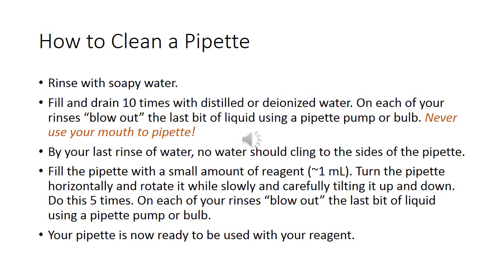This will be different from what I'm going to tell you in a few minutes. I'm going to tell you in a few minutes that when you're measuring, you never blow out a pipette. But when you're cleaning a pipette, you want to make sure that you blow it out the bottom.